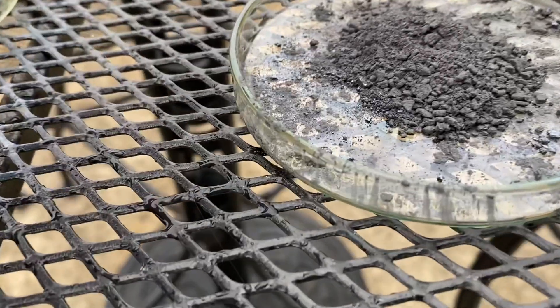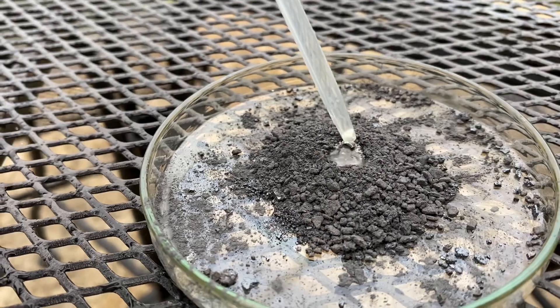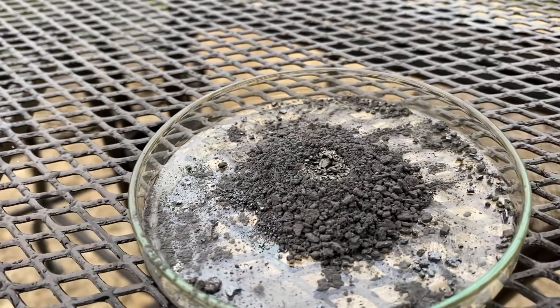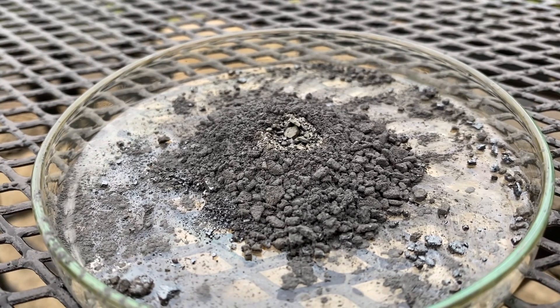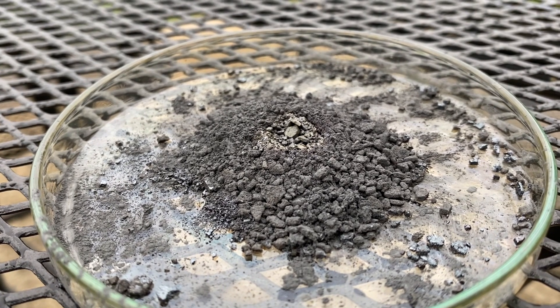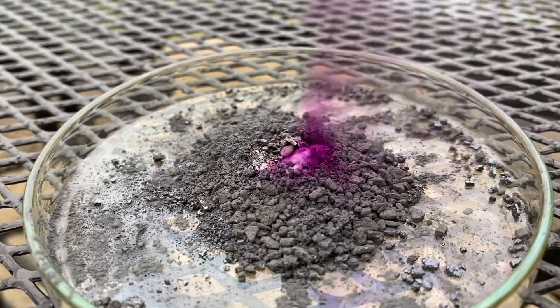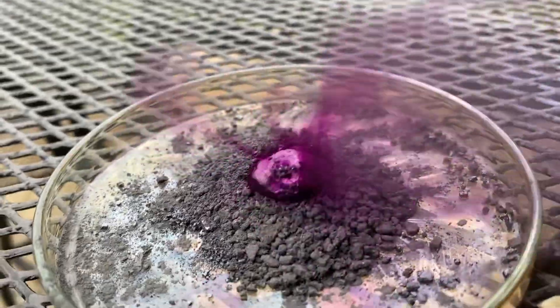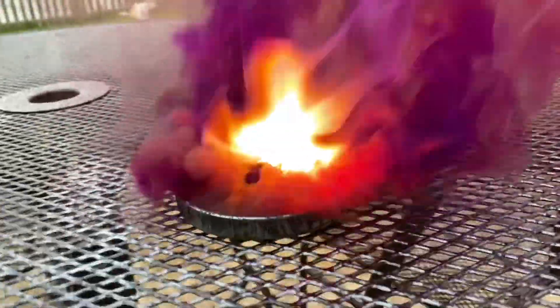Here we go. You can start to see it react. Here it goes. Beautiful purple vapor. And there's the reaction.